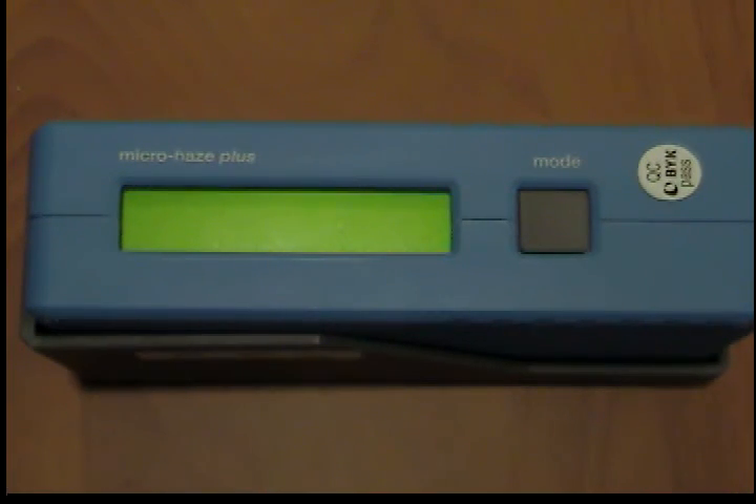Otherwise, check whether the gloss standard in the holder or the secondary standard is dirty. If cleaning the standard and another calibration do not remedy the problem, please contact customer service.